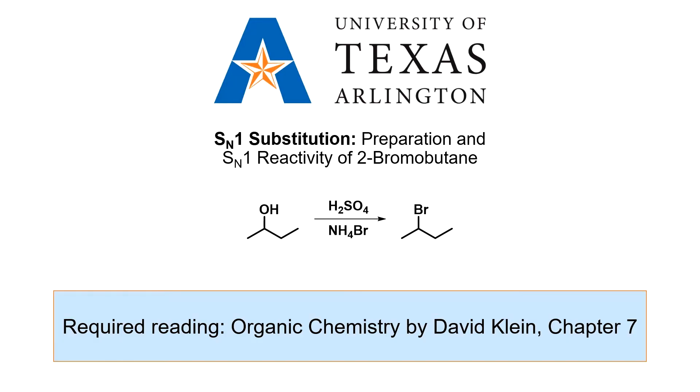In this experiment, 2-bromobutane will be synthesized from 2-butanol. The SN1 reactivity of 2-bromobutane will then be assessed by comparing the rate of the reaction against a set of alkyl halide reference samples.